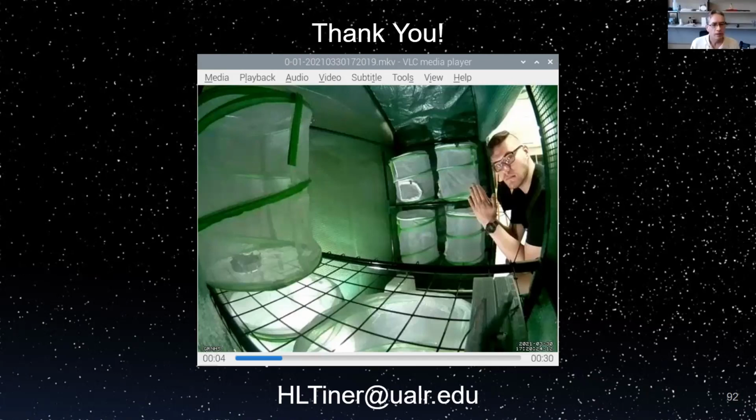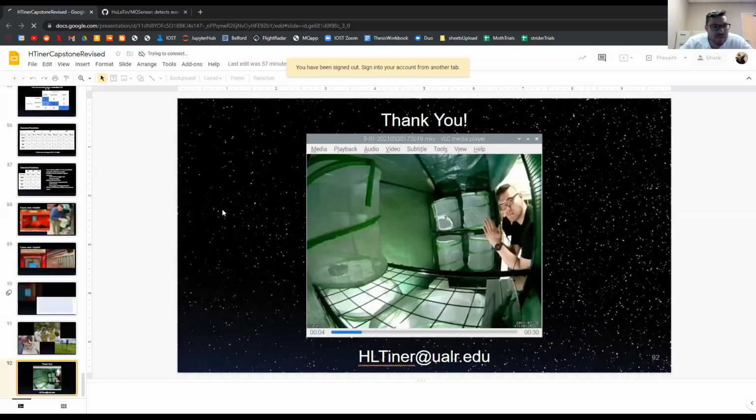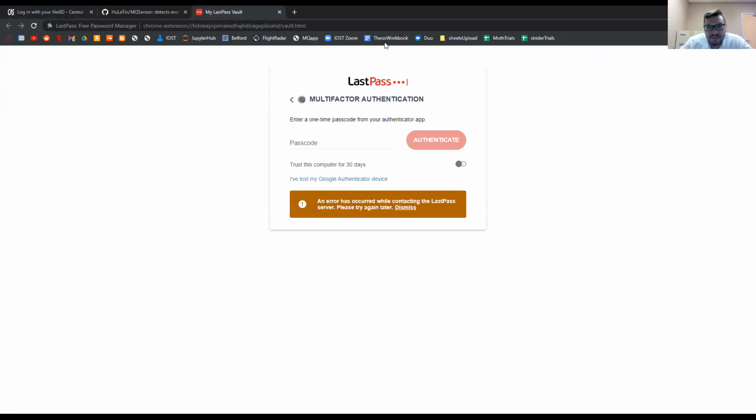On slide 50, did we see some saturation of signal? Yes, and oh, shoot. Give me one sec, I apologize. Let me stop my share real quick. So the saturation of signal, yes, some of our chemicals will reach a value of 1 on our sensing elements. Give me one moment, I apologize. That was not supposed to happen.